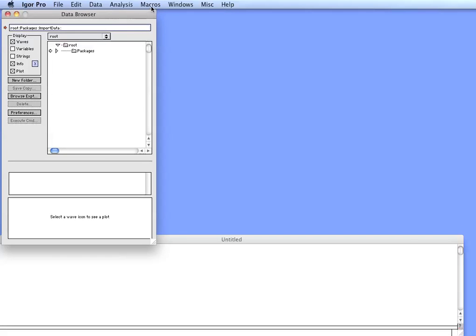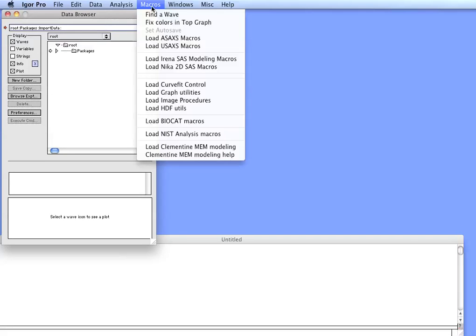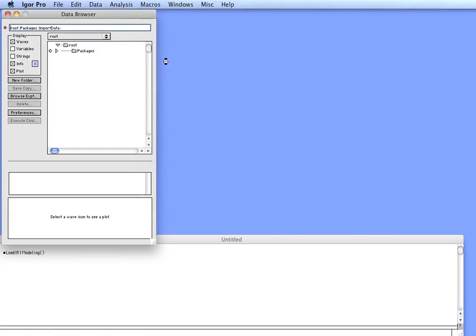First, what you want to do is in Igor load the IRENA macros and compile them. That may take a bit.